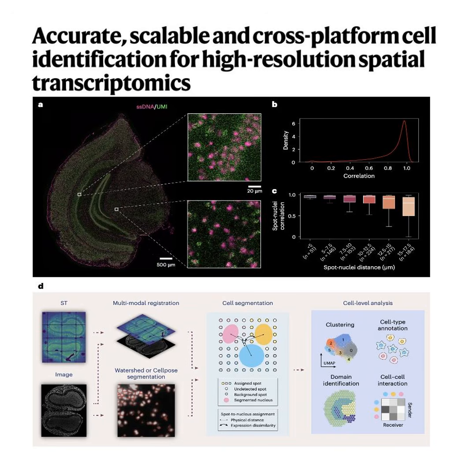Currently, yes. Well, Cellist turns blurry spatial transcriptomics into high-fidelity maps, but it leaves me with this really provocative thought to mull over. What's that? If we are moving toward a world where algorithms can computationally reassign diffuse molecules back to their origin with such incredible probability, are we eventually going to just stop trying to perfect the physical tissue chemistry in the wet lab? Like, will we rely entirely on AI and math to clean up our messy biological data post-capture? That is a massive question. Where is the line between biological measurement and computational reconstruction?